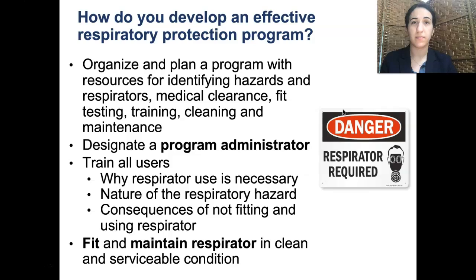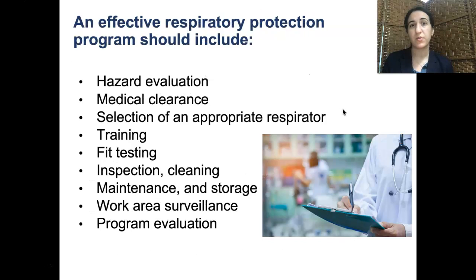An effective respiratory protection program should include hazard evaluations, medical clearance, selection of an appropriate respirator, training, fit testing, inspection, cleaning, maintenance, and storage of respirators. Lastly, work area surveillance and program evaluations are important for quality improvement. Let's take a closer look at each of these components.